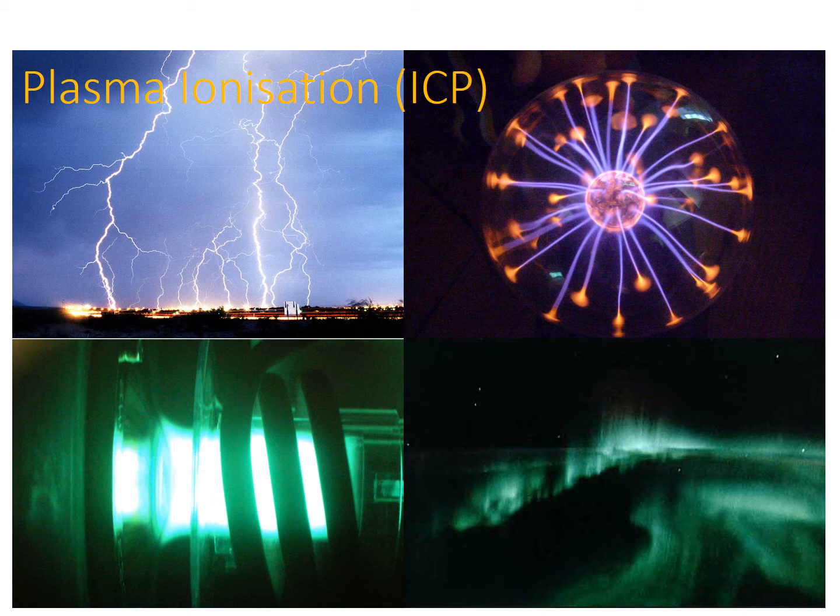Plasma is basically what you see in lightning. Because you have to separate the electrons from the positive ions, you have to have an extremely high temperature. And that's useful. These are other examples of plasmas. If you can create a plasma, that means you are creating a mixture of ions and electrons, and that's all we're doing, basically. We're using this inductively coupled plasma as an ion source, to turn our sample from neutral atoms and molecules into ions.